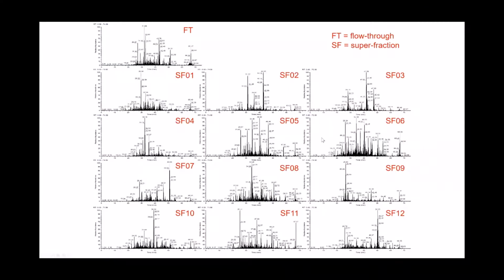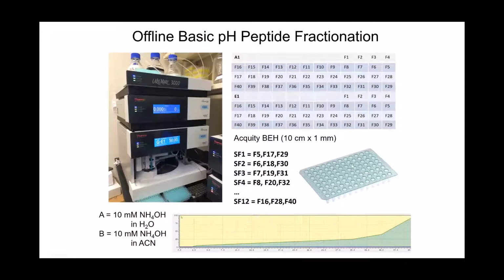Do you mind elaborating a little more about when to use TMT and when to use DIA? Yeah, so with TMT, you're going to get more proteins identified. So if you have a very clear experimental design where you've got 5 samples versus 5 samples and it's just a 2 sample group project, I would go TMT for sure. You'll get more proteins, deeper sequencing, and very quantitative data. If you have more than 2 groups and you need a lot more replicates and you've got to go across batch, then we may go back to DIA. Some of our serum projects actually work a lot better with DIA.